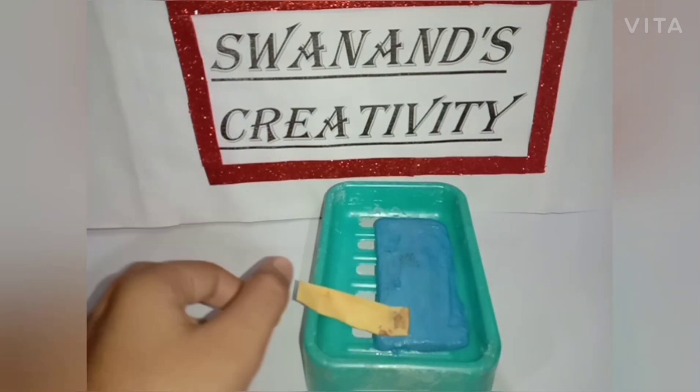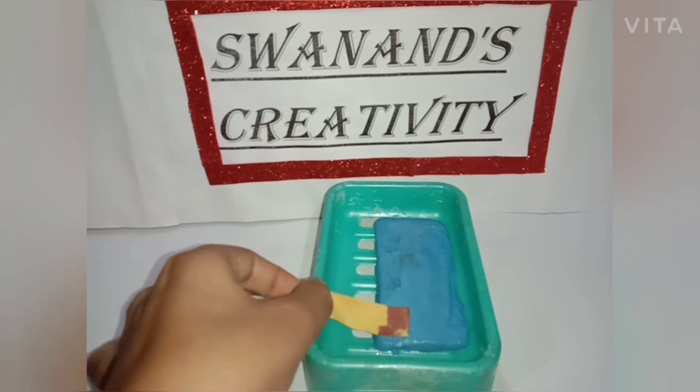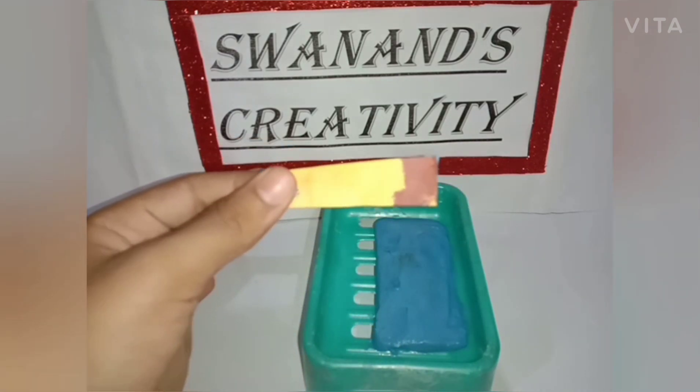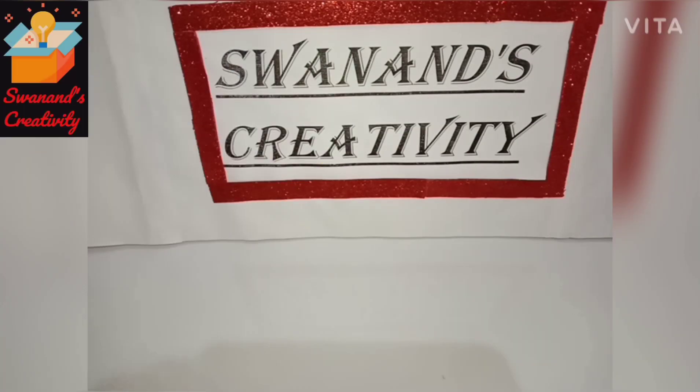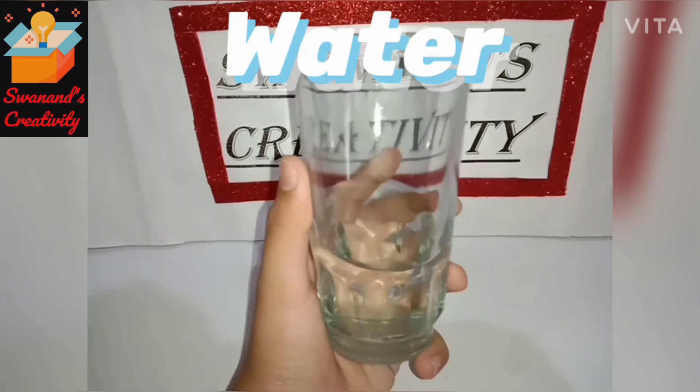Hello everybody, welcome back to my YouTube channel Swanan's Creativity. In this video we are watching how to make litmus paper at home. So let's start our video. The materials we need are half teaspoon turmeric powder and water and a piece of ordinary paper.